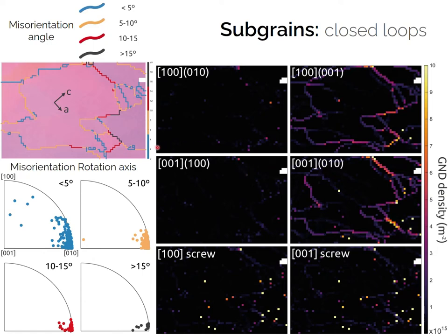three-dimensional subgrain cell. Theoretically, to generate a closed cell, we will need other types of dislocation generating rotations in other directions. Here we see these subgrain cells apparently closed because the olivine crystal has the B-axis perpendicular to the screen.